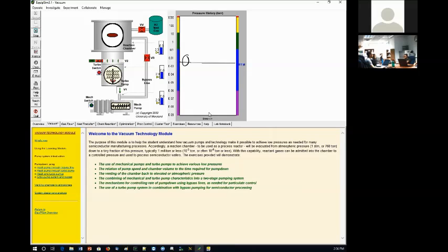That's because it doesn't have to go from the reaction chamber all the way down to the pump, or straight down from the chamber to the turbo pump to the mechanical pump. I mean, geometrically, this is not a great representation of the length of the things, but in a sense, you're right, because the bypass line is very thin, like I was saying, so its conductivity is low. So what do we mean by conductivity?